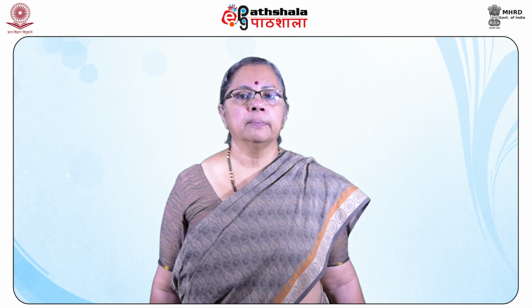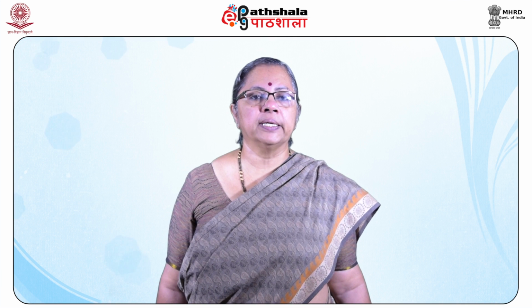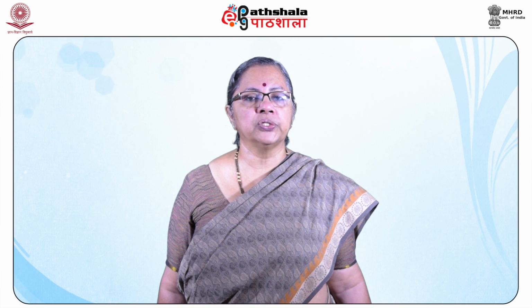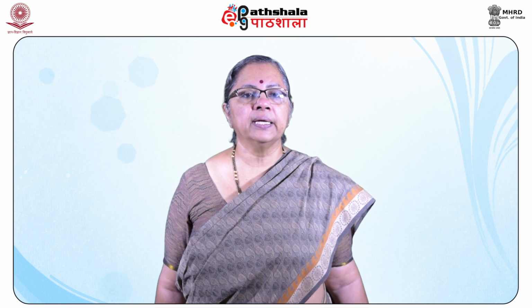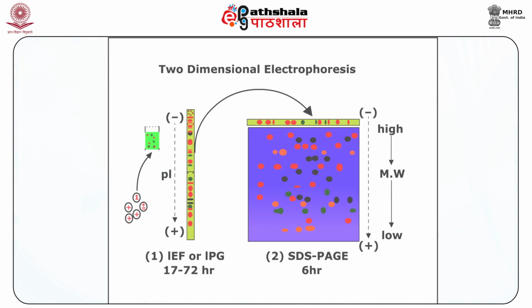This is possible by using low molecular weight organic acids and bases, namely ampholytes, in the capillary tube containing the polyacrylamide gel. The ampholytes distributed in an applied electric field, as indicated in the figure, set up a pH gradient.